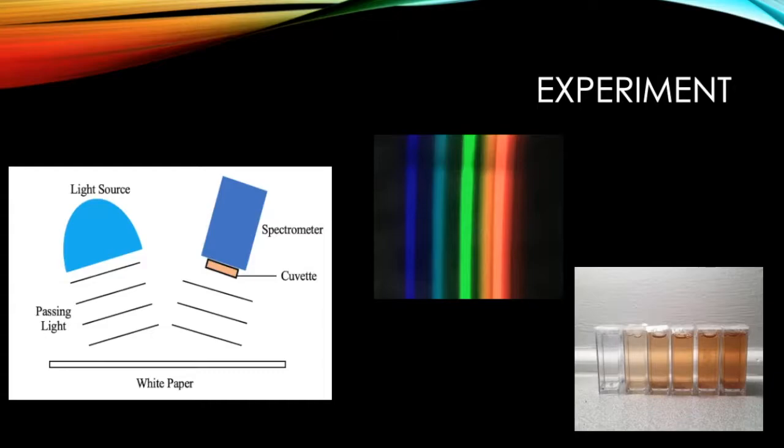This image was then uploaded to Spectral Workbench where it could be analyzed using software on the site. This was done for each concentration of T. The concentrations chosen were 20, 40, 60, 80, and 100%, and a control solution of 0 concentration, purely distilled water. The 6 solutions can be seen in the bottom right image.